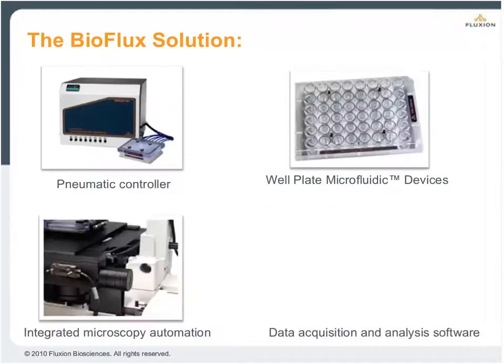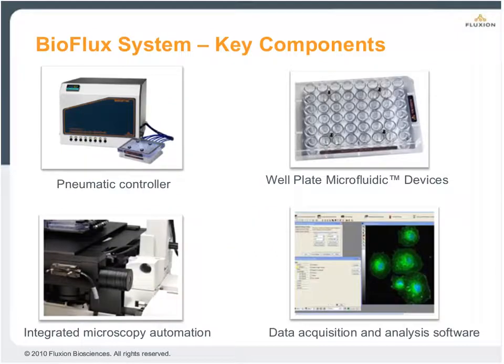At the heart of the BioFlux is the pneumatic controller, which is shown on the upper left. It affords very tight control over fluid handling. And then the controller couples to the microfluidic plate, or what we call a well plate microfluidic device, via an airtight interface, which I'm pointing to right now on the lower part of that panel.